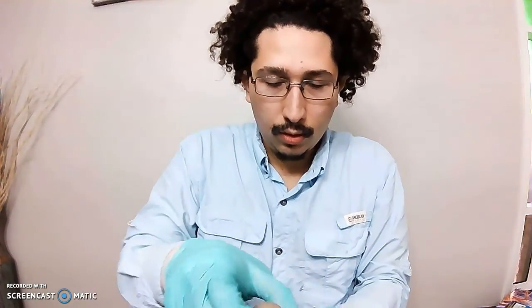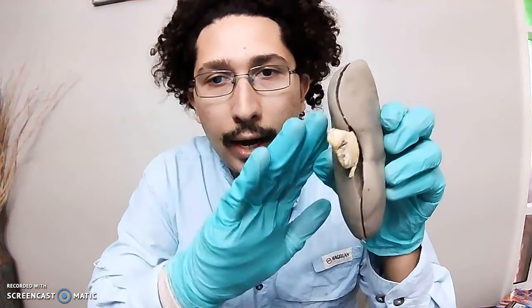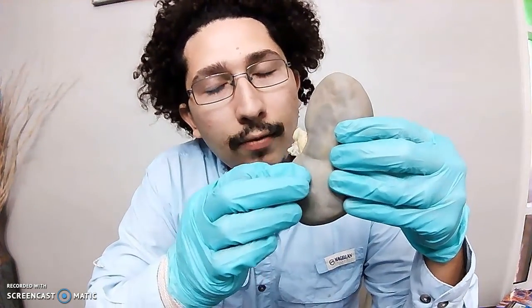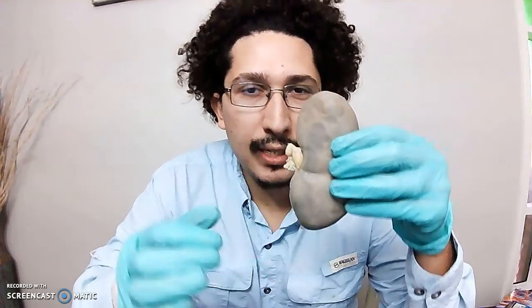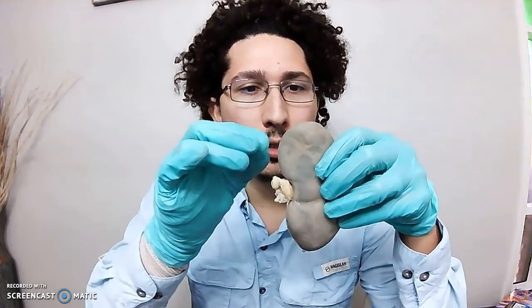Okay, so here is the sheep's kidney. The outside is covered with the renal capsule. It's a fibrous capsule, usually kind of transparent when you actually see it.